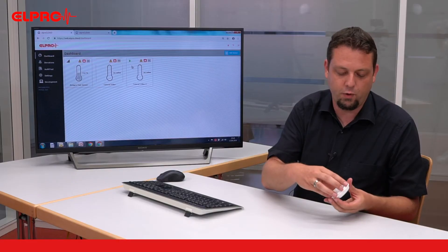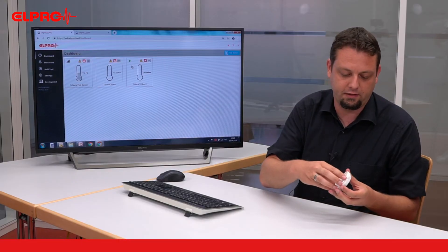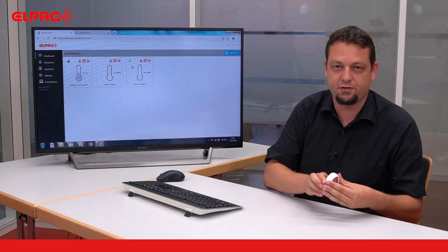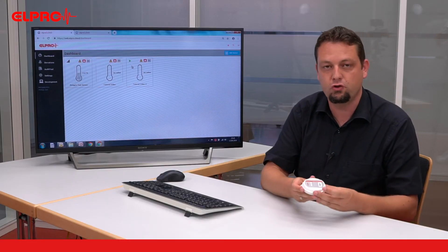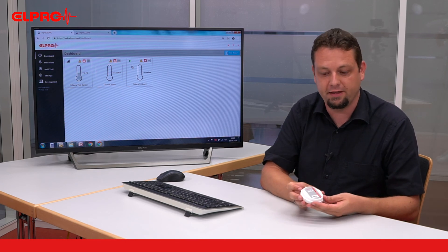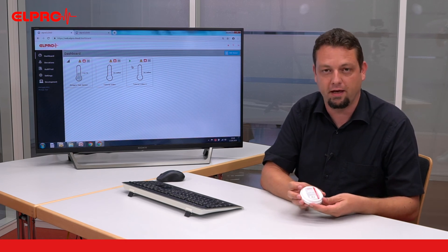Now we can close the lid again and our sensor is ready to measure the temperature at the place you would like to have it.